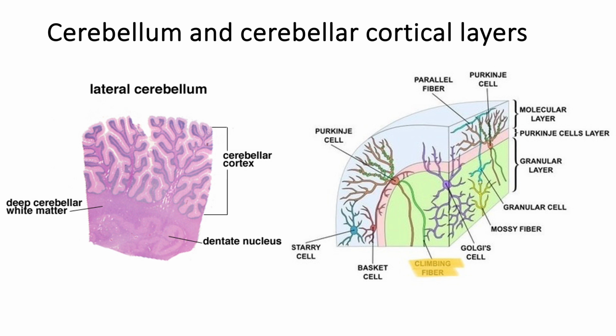The cerebellum contains these layers as we have seen. However, the very nice architecture, the arborization of these, is very peculiar to the cerebellum, the cerebellar cortex.